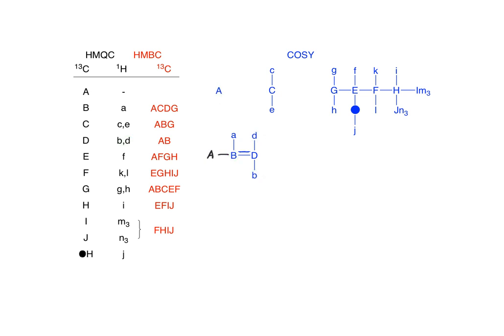For the 6th carbon fragment, let's look at proton F. Proton F shows a correlation with carbon A. So that also must be a 3-bond coupling.